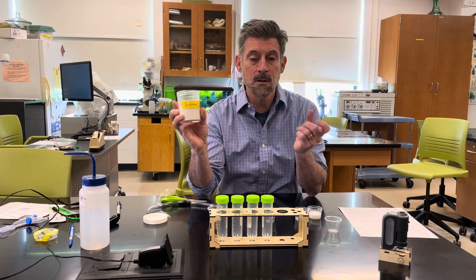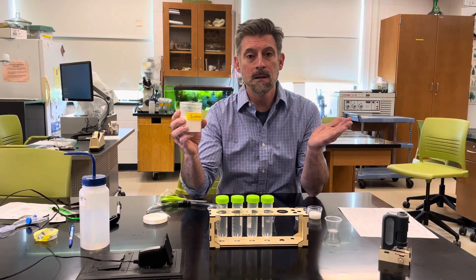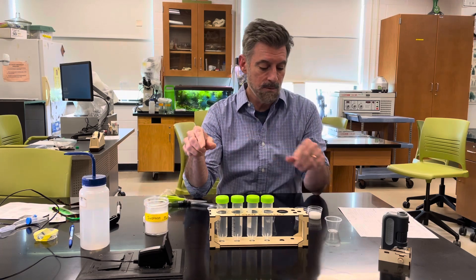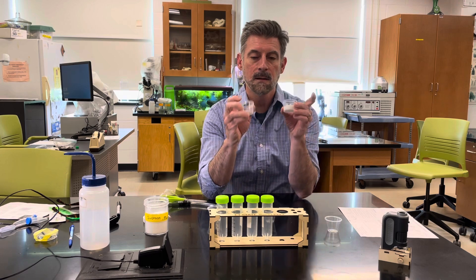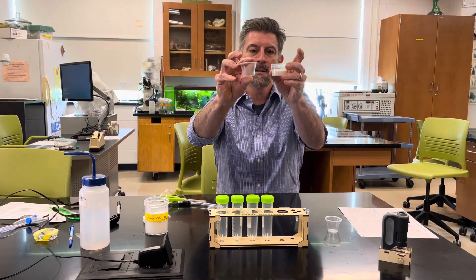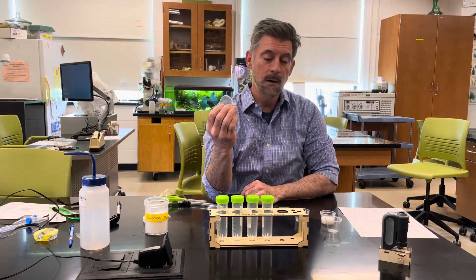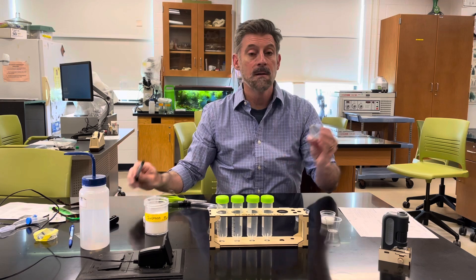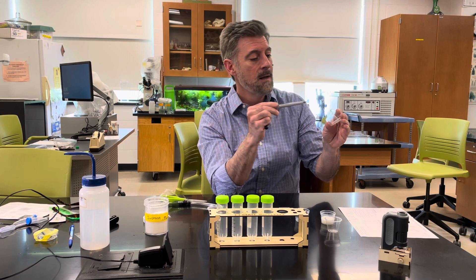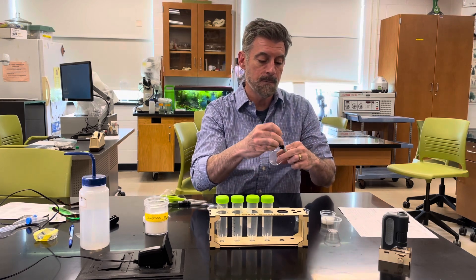You can use little packets of sugar or a big giant bag of sugar — nothing particularly special. You're going to be measuring it out in measuring cups. Some cups are a little more difficult to read, so I recommend finding a place with good lighting and then taking a sharpie to highlight the markings so they're easier to see when you're setting things up.